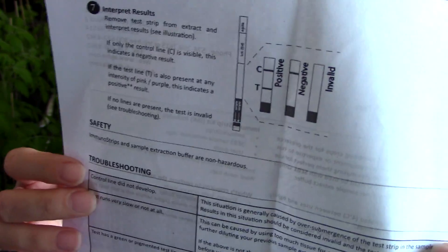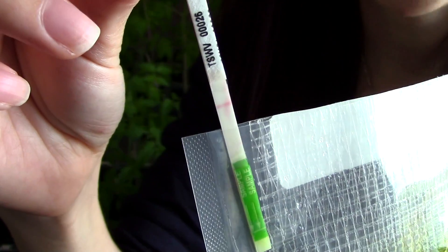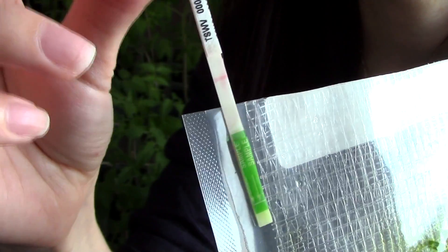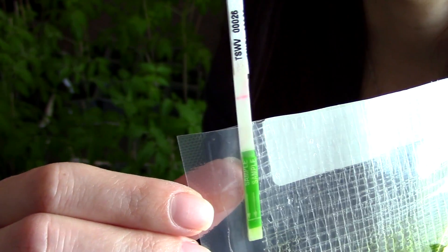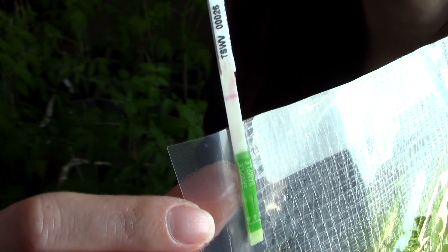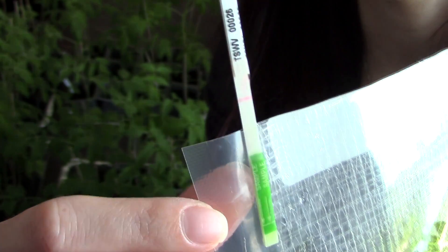A few minutes have passed. Looking at our test, we can see we have one single line — the control line — situated above. If there had been two lines showing, then our plant would have been infected with a virus. But since there is only the control line, we do not have a virus. So yay for my brother — he is going to have tomatoes that are not infected with the Tomato Spotted Wilt Virus.